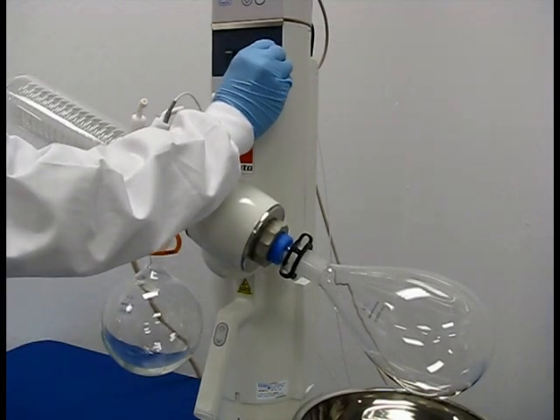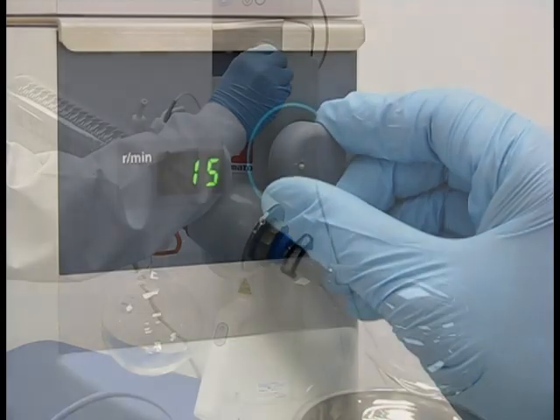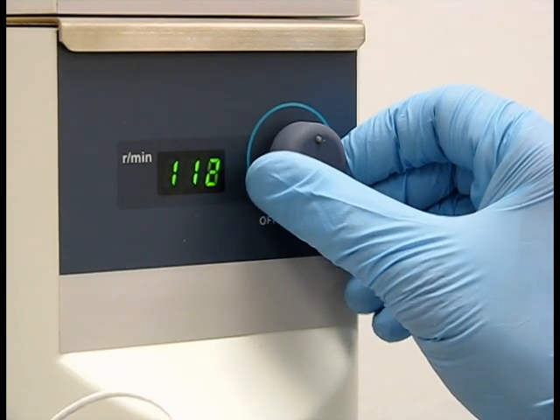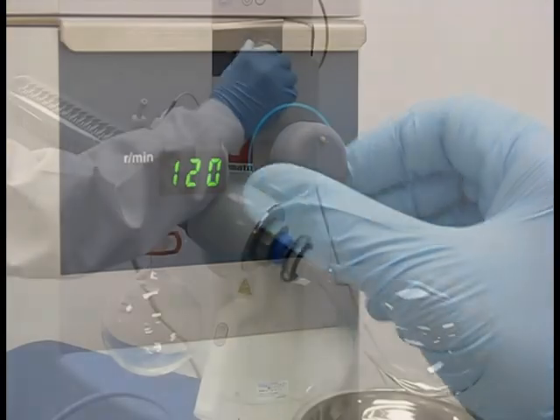After loading your sample, begin rotating the sample evaporating flask by adjusting the knob on the main unit clockwise until the desired RPM level is reached.